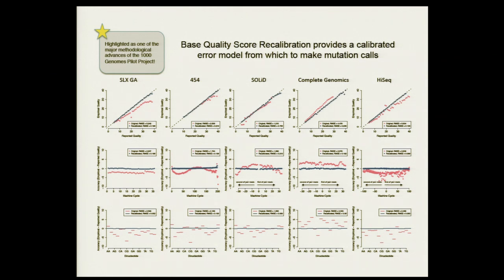So we've tried lots of things, actually. We've tried even crazy things like time of day. And these are always the ones that we come back to. They seem to very consistently show a bias. We've done things like homopolymer length. We're experimenting right now with things like repeat length to try to capture things about short tandem repeats. And these things are interesting, but they haven't proven to be so successful yet. So I would say these are the big ones. We haven't found others.